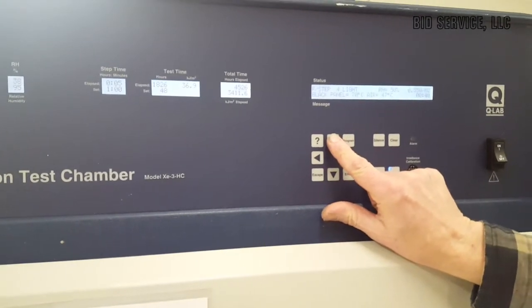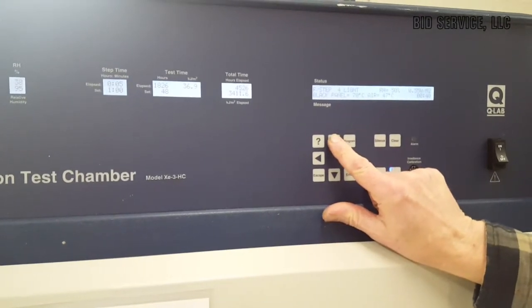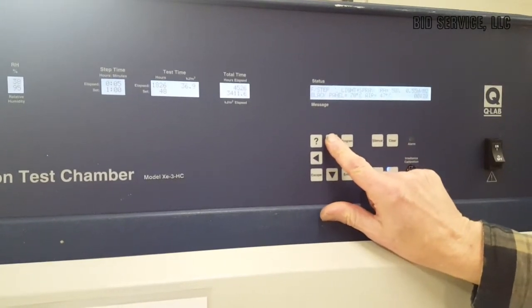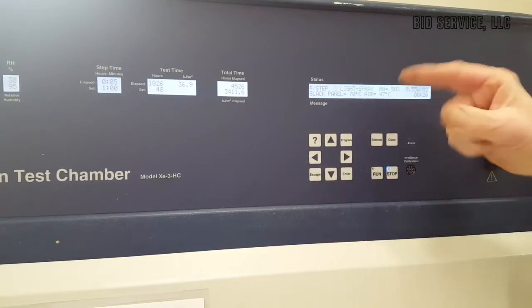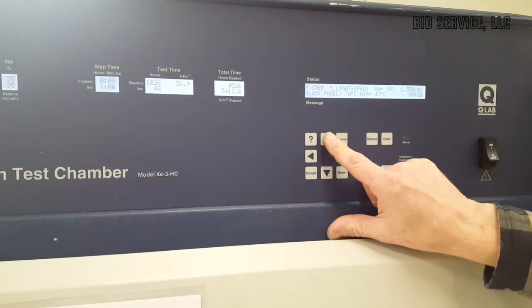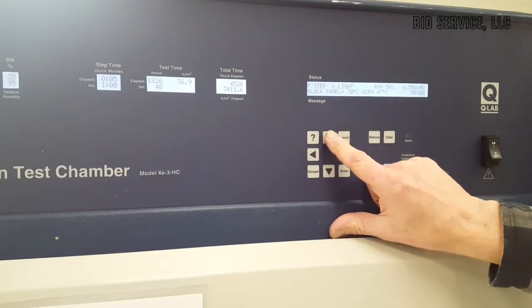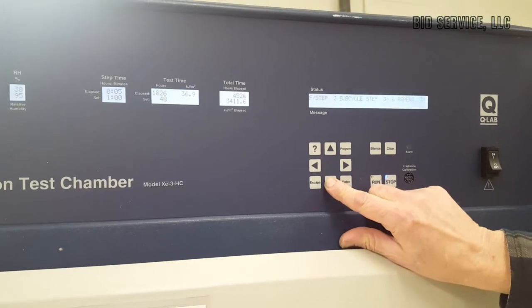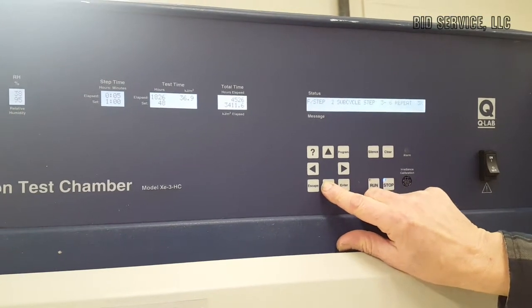Here are different operating modes. We can operate in light. There's a water spray option that's available. And I'm just going to run the same numbers.